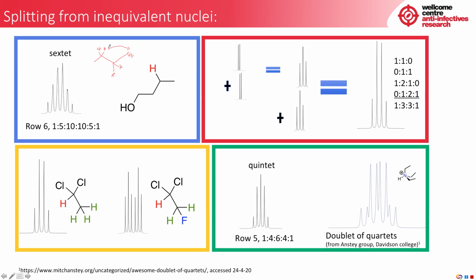So I have got this particular signal simulated from butanol, and it's this proton here, and it couples twice there to give you a triplet, and 3 times here to give you a quartet, and this signal could also be considered a triplet of quartets where the J values are close enough that they overlap to give you this sextet.